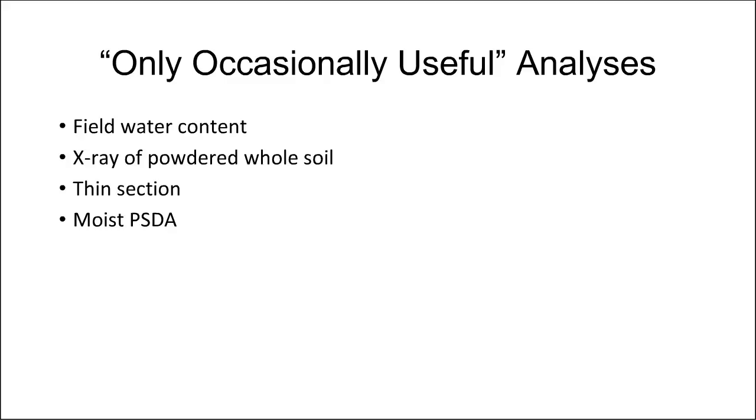Moist PSDA is another analysis that's requested more often than it's relevant. It is only preferred in materials that change irreversibly on drying, meaning they haven't dried in the field in the last umpteen decades. And there are some areas in Hawaii that are like that, but for most soils that occasionally dry, there is no benefit to running a moist PSDA. In fact, it's probably a little less repeatable than the dry PSDA.